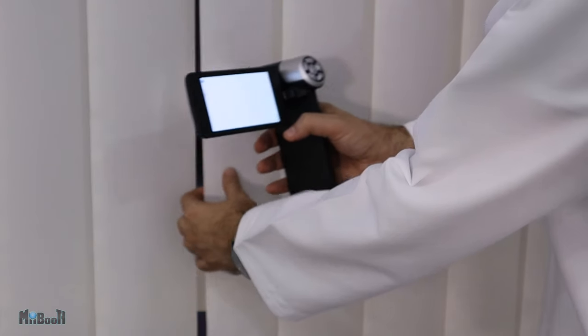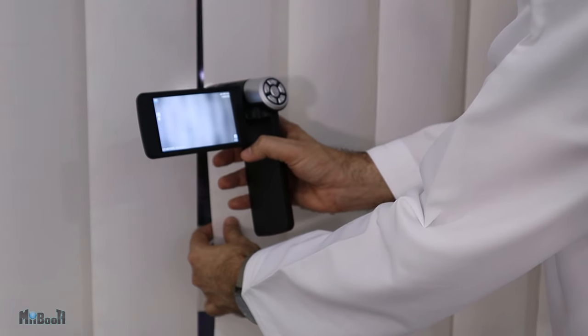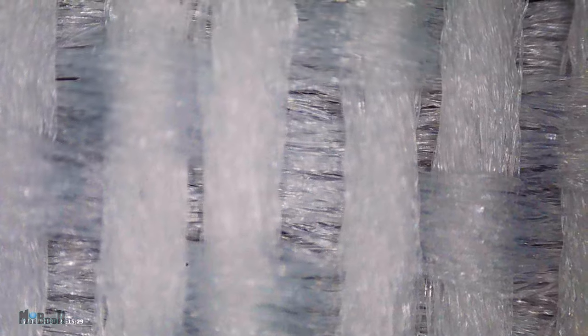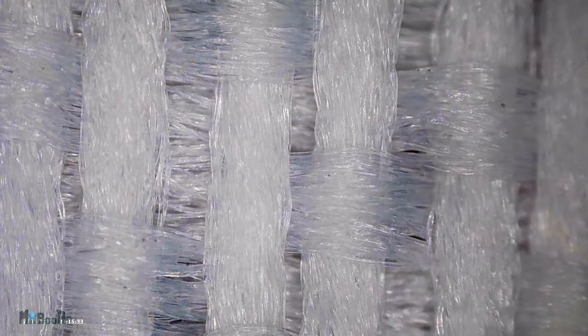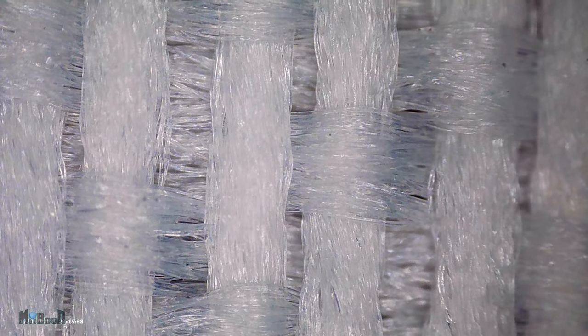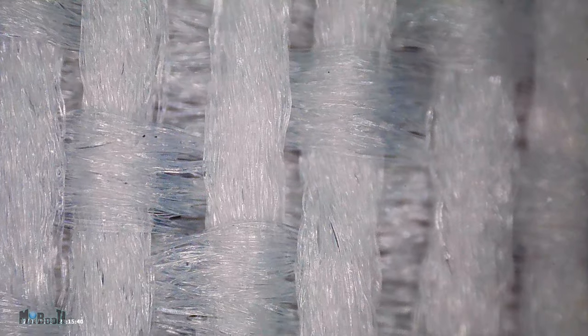The best part about this microscope is that you can walk up to anything, hold it right up against it, and there you go — instant magnification. Look at how clear the image is. Even though I've seen it a hundred times, fabric still fascinates me under a microscope. Look at how giant the individual strands of thread look, and it looks like each individual strand is made up of dozens and dozens of smaller and thinner strands. It just looks amazing.